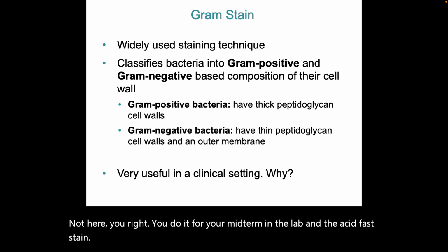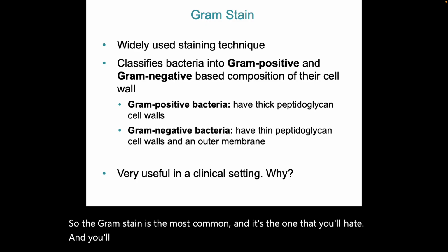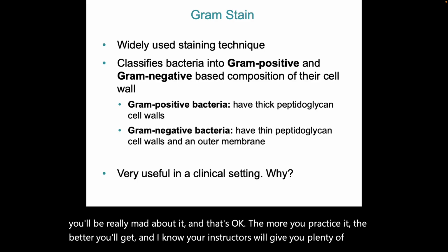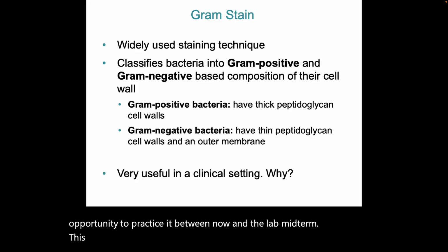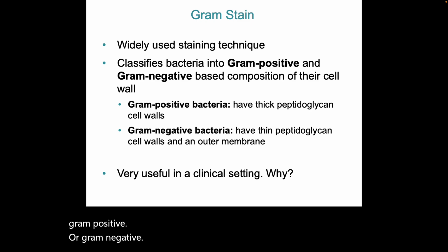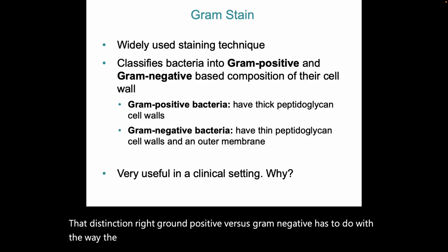The gram stain is the most common, and it's the one that you'll hate, and you'll be really mad about it, and that's okay. The more you practice it, the better you'll get. And I know your instructors will give you plenty of opportunity to practice it between now and the lab midterm. This allows us to differentiate whether or not a bacterium is what we call gram positive or gram negative. That distinction has to do with the way the cell organizes its wall.